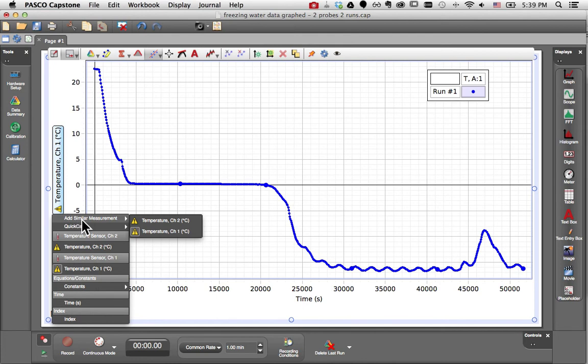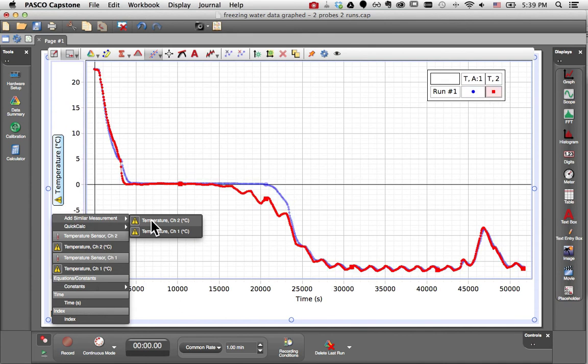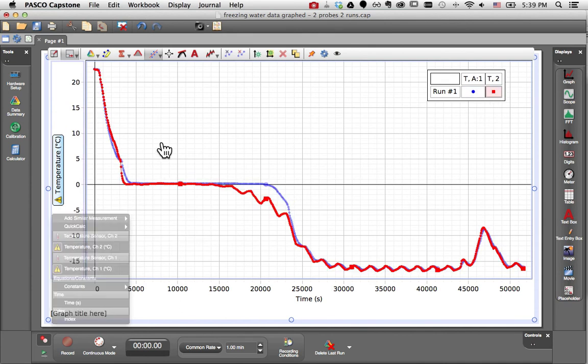Pasco Capstone offers the Add Similar Measurement feature whenever it sees measurements that share a common type. Of course, the two temperature probes shared a type of temperature, so I can select both of them at the same time.